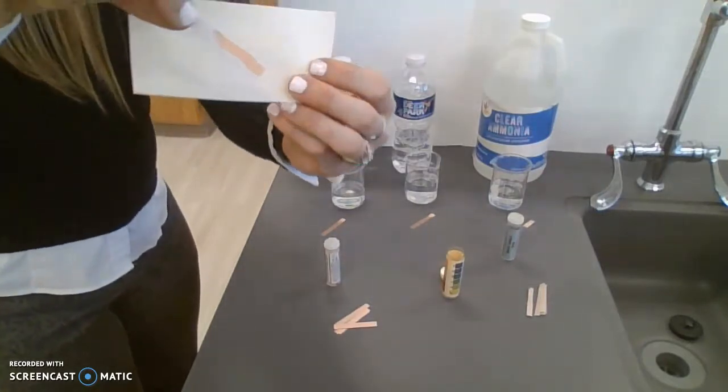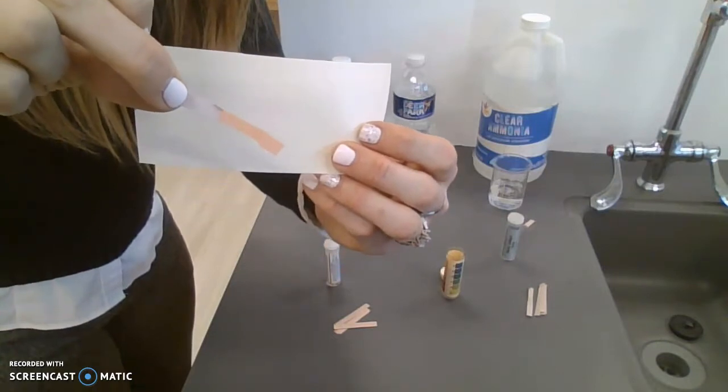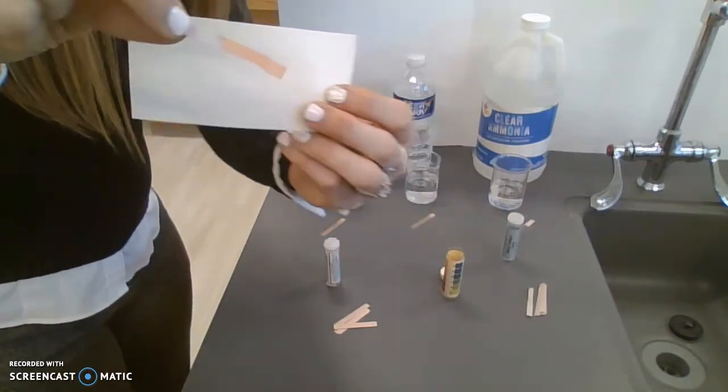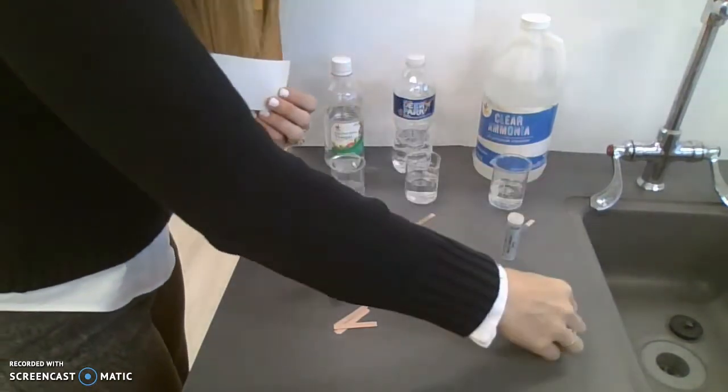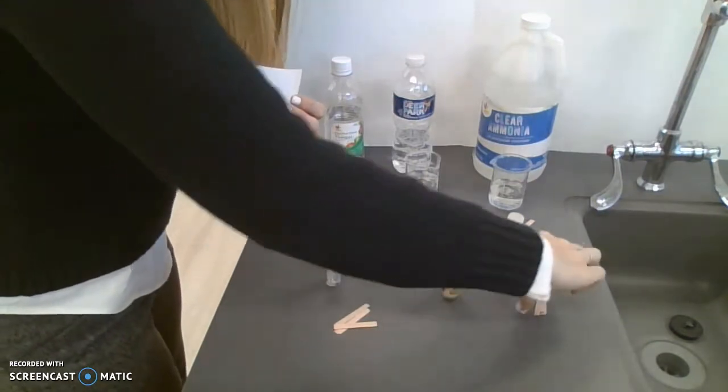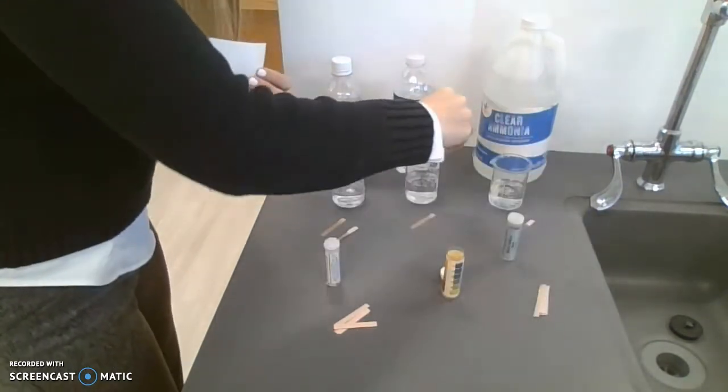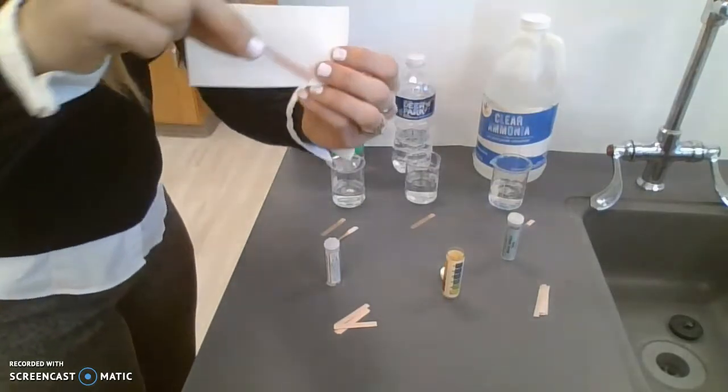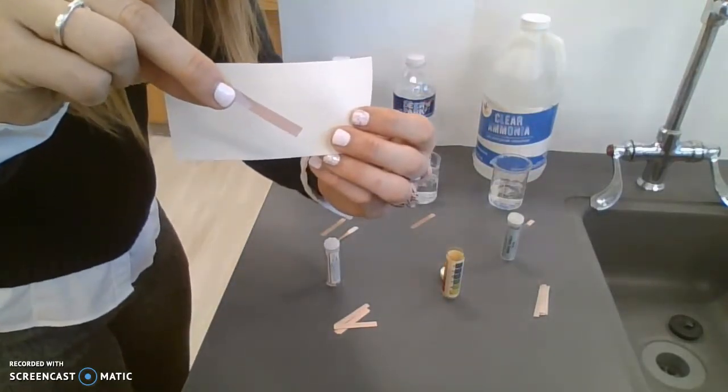If I take blue litmus paper and dip it into water, you can see more of a distinction between the blue near my fingers and the wet part at the bottom. Blue litmus in water will just appear wet, so it doesn't change red or blue.